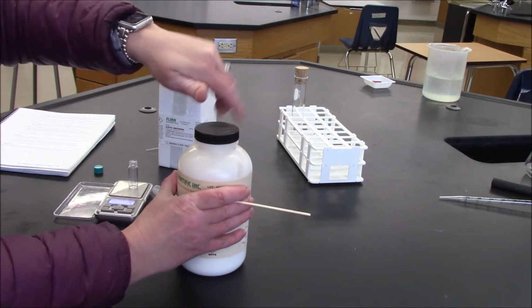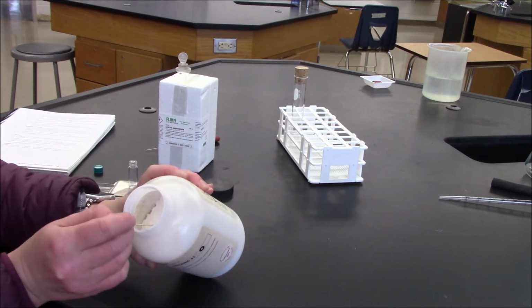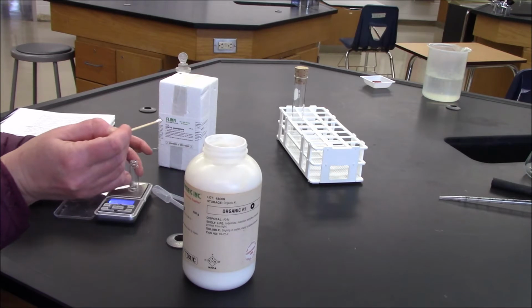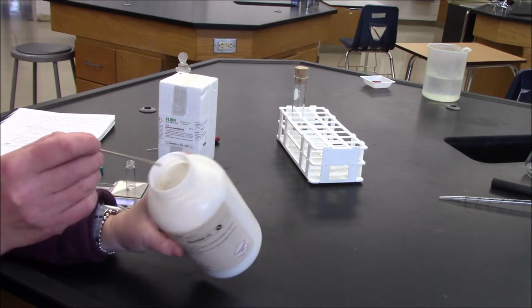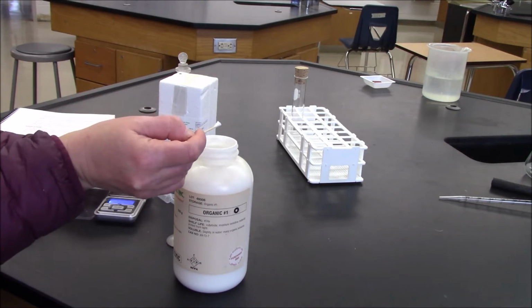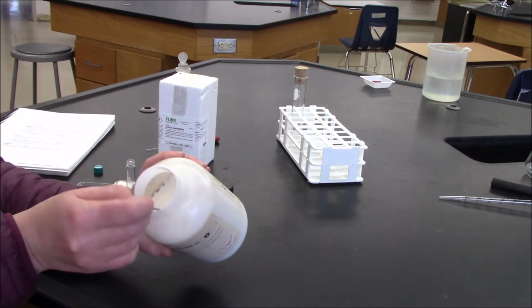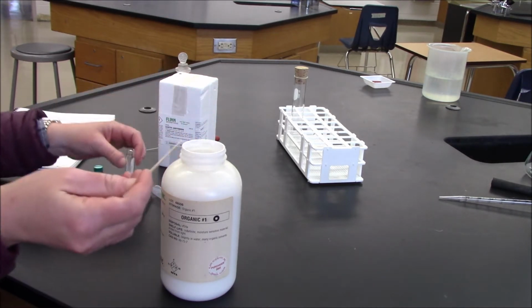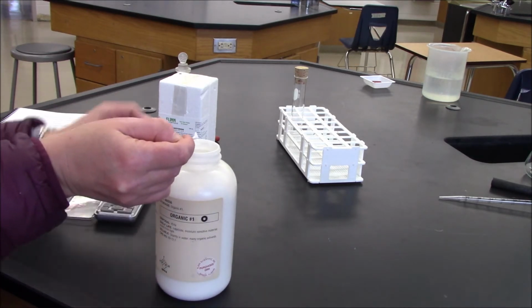Let's see how I do with this. 1 gram. All right, 1 gram is going to be quite a bit, I guess.